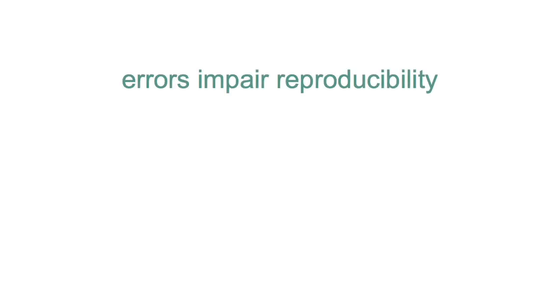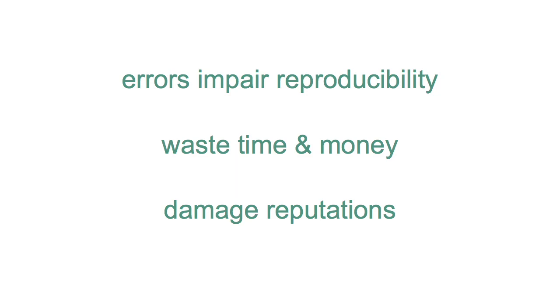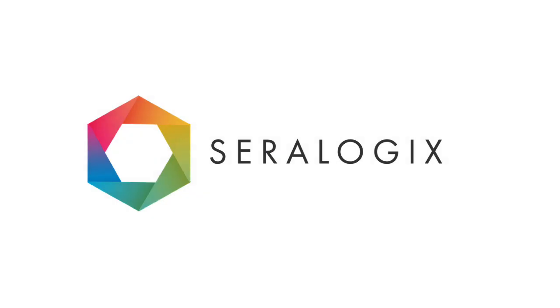Preclinical studies are a major undertaking and carry considerable risks of errors that impair reproducibility of study results, wasting time and money, and potentially even damaging reputations. Use of the Seralogix Study Manager significantly reduces the chance of these painful errors, while simultaneously making studies smoother and easier to design and manage.